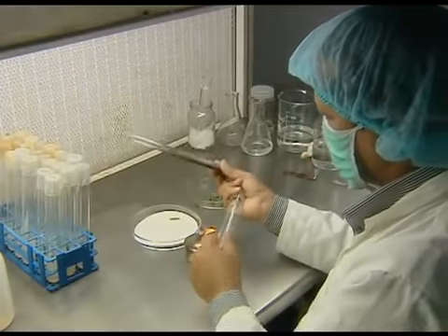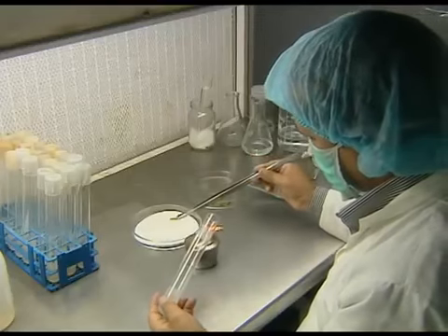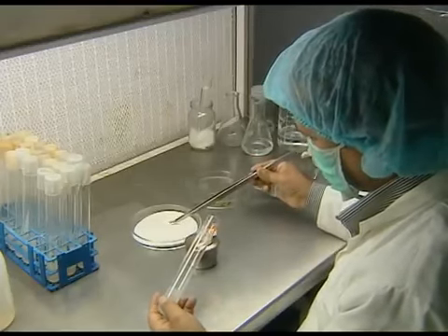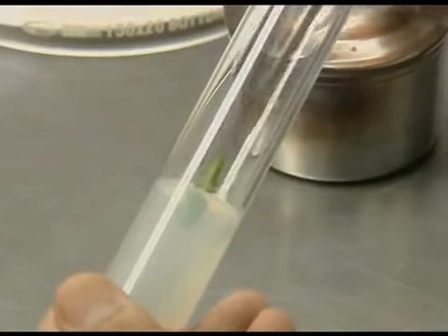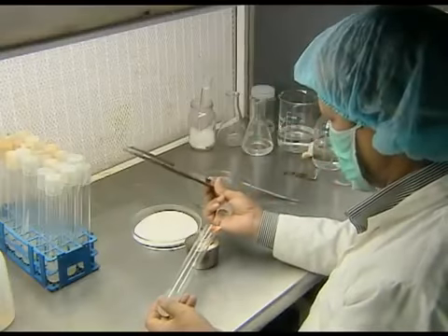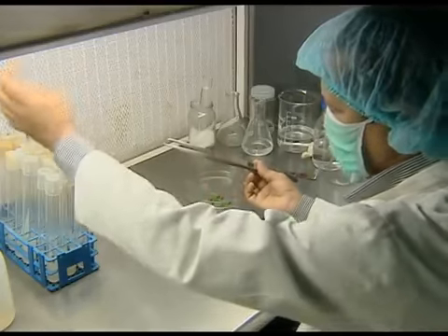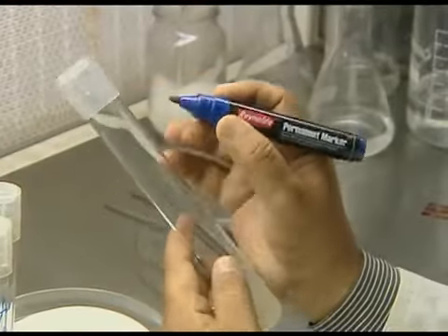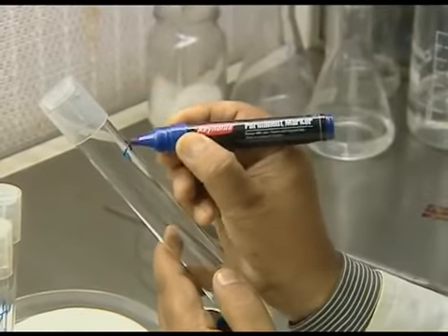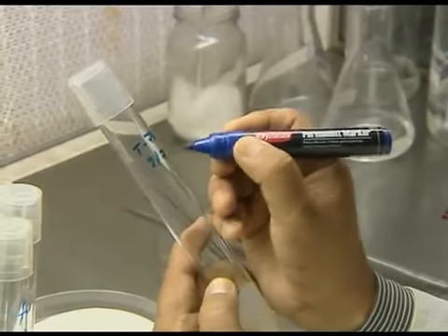Each nodal segment is carefully inserted into the medium contained in the test tube, and care is taken to avoid the explants from touching the rim of the flask, which is again flamed, and after that, the cap is put back at the mouth to seal it tightly. Finally, the name of the plant, medium, and date of inoculation is labeled onto the surface of the test tube.